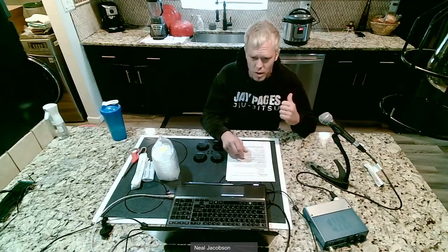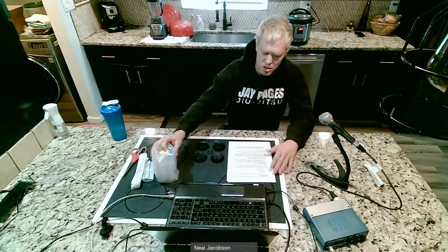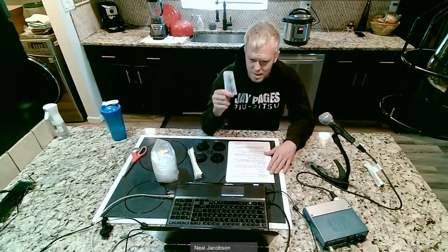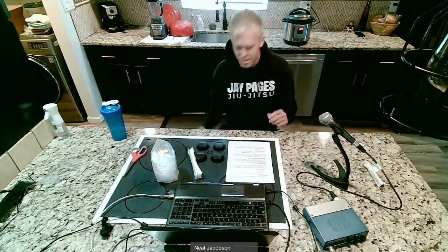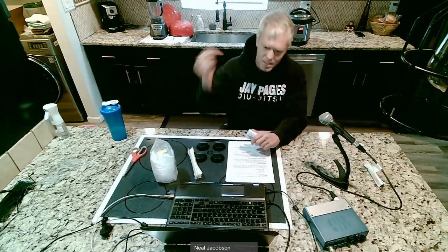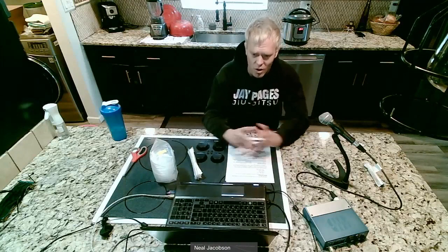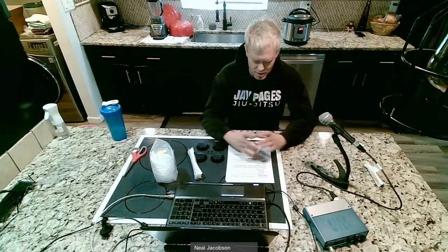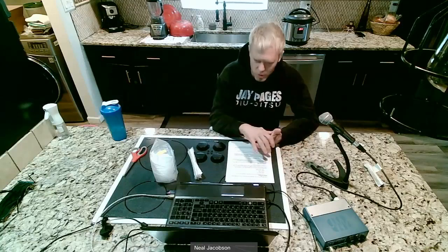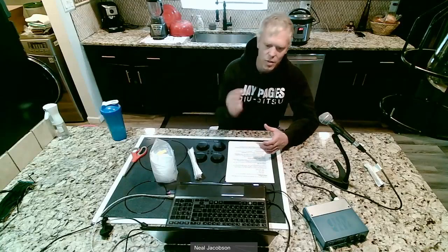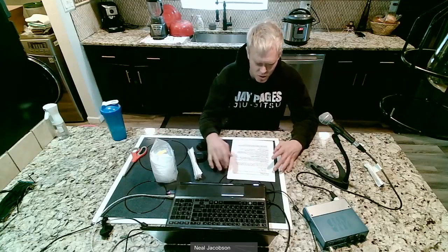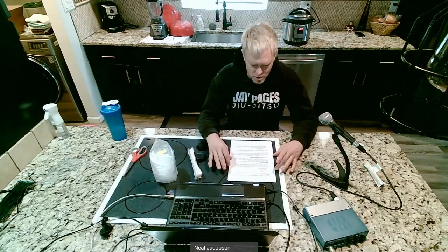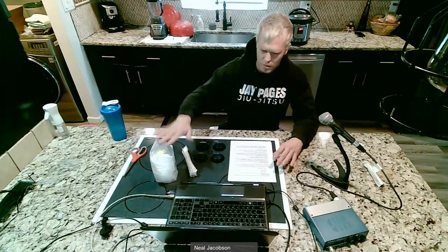Some of the stuff you're going to need: your two bottles of nutrient agar, your 10 petri dishes, 10 sterile swabs. You do not need tweezers. You are going to need this though — this is your parafilm. That's how you're going to seal the edges of your plates so that bacteria can't climb into your petri dish and contaminate it while you're cultivating your plates. Once you swab your plates, put the lid on and seal it off so nothing can get in there and contaminate your specimen. You don't need tweezers or plastic transfer pipettes, but definitely the swabs, definitely the parafilm, and definitely your dishes.